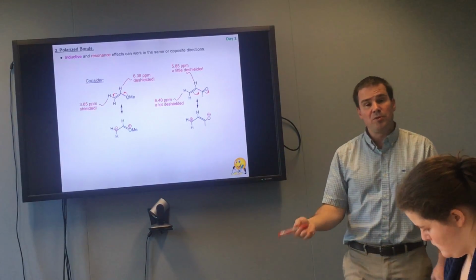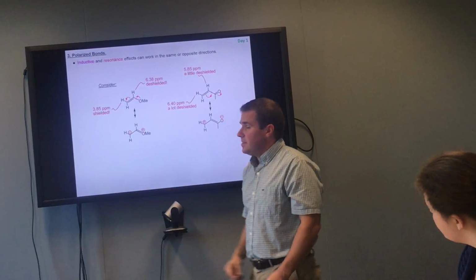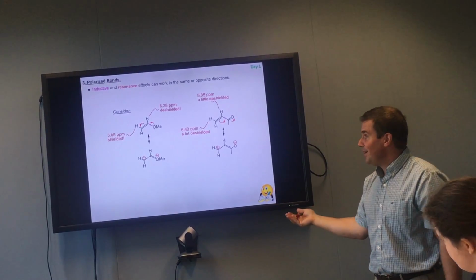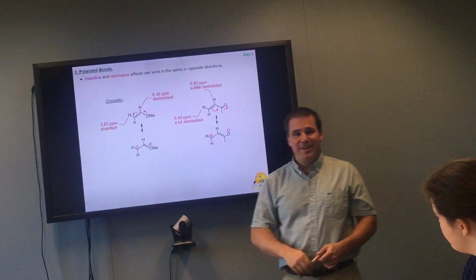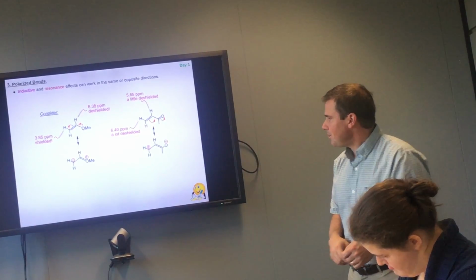As a result, we need to apply more magnetic field if we're doing an old continuous wave NMR. That moves in the upfield direction on our proton NMR, all the way from 5.25 all the way to 3.85. That's a lot. It's weird to see an alkene upfield of 4 parts per million. That's what we get with these kinds of really electron-rich systems.